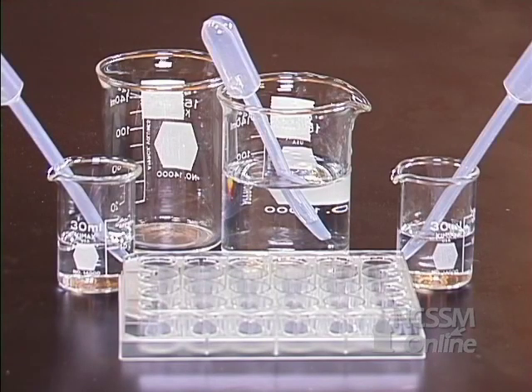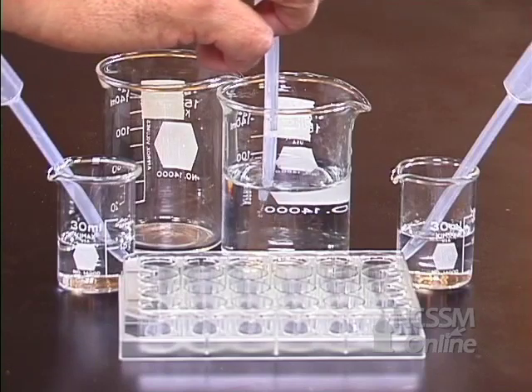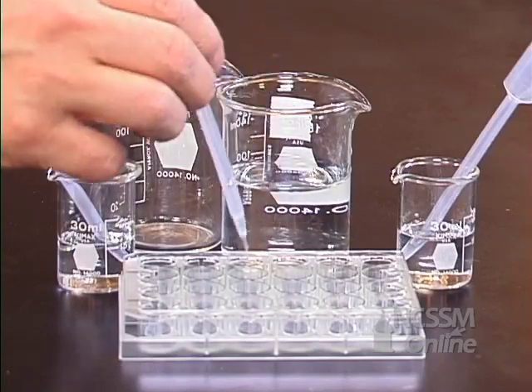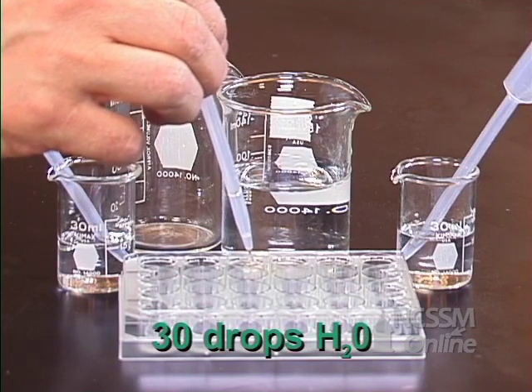You're going to make a series of solutions from pH 1 to pH 13 by doing a serial dilution. In the second row of your 24-well plate, place 30 drops of distilled water.